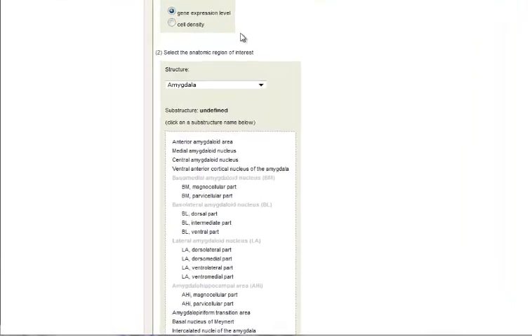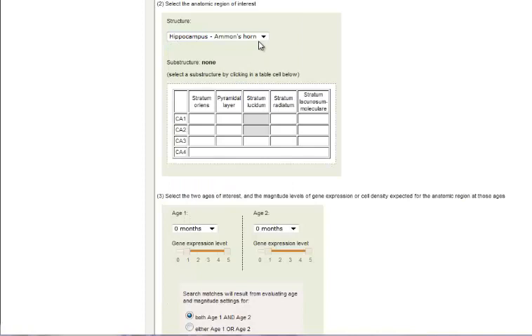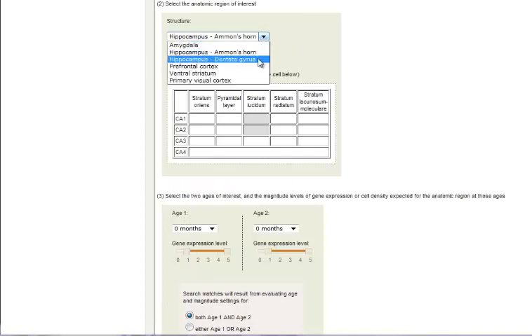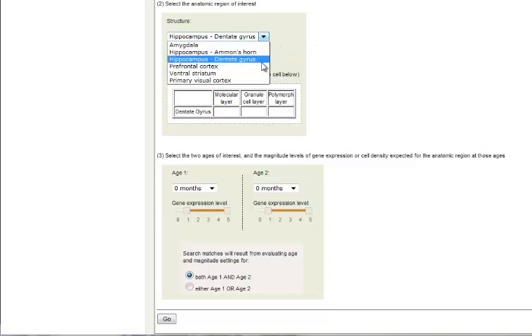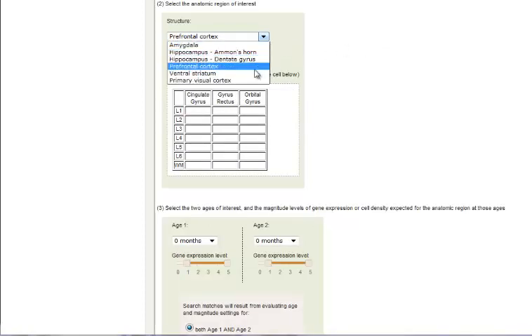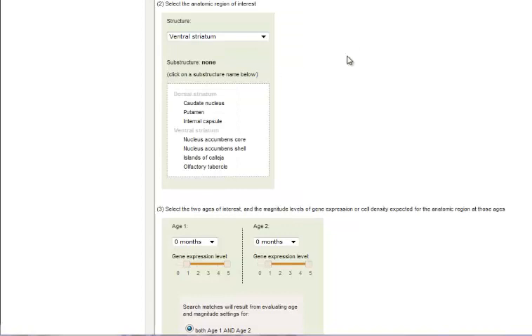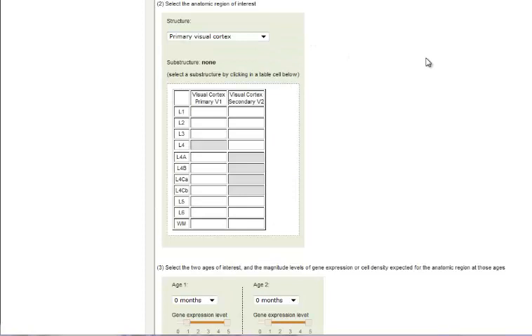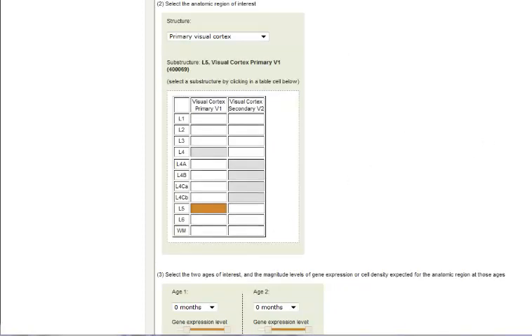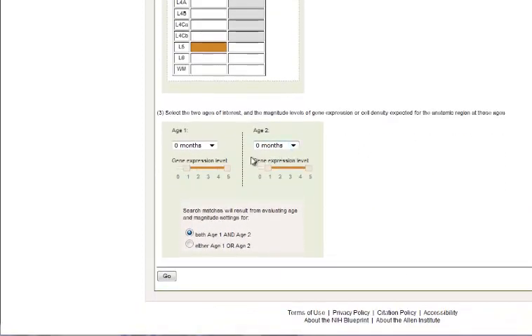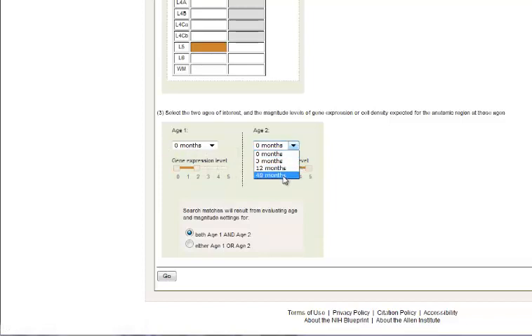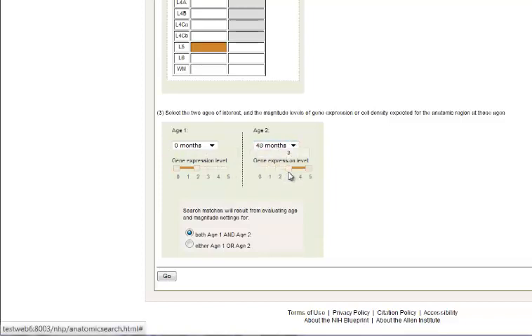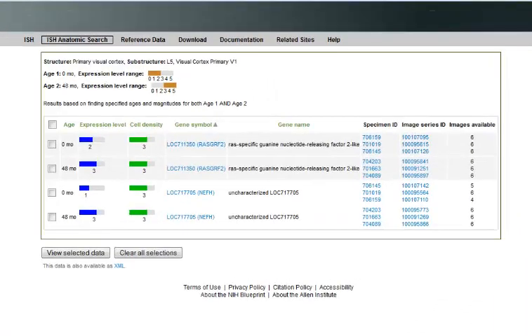Next you'll want to search on a substructure. Each structure will give you a different choice on the types and layers of cells to choose from. We will choose the visual cortex in layer five. To look for genes that get turned on over time in the visual cortex layer five, we'll choose low expression at early points and high expression at the oldest stage. We'll keep the default search to both of these constraints. You'll notice that two genes are returned, and while both genes show similar cell density, the intensity has increased over time.